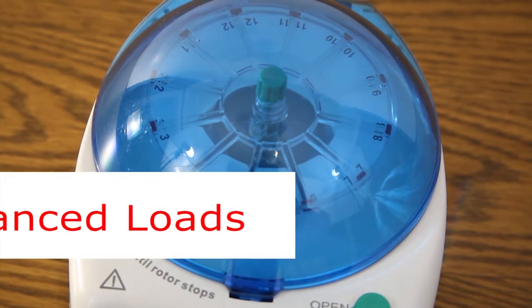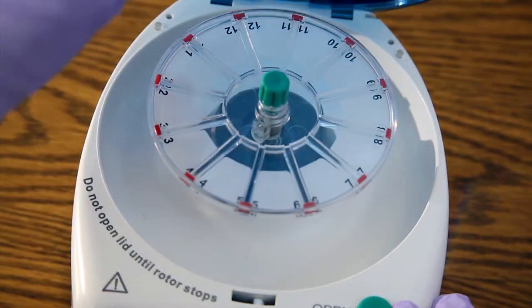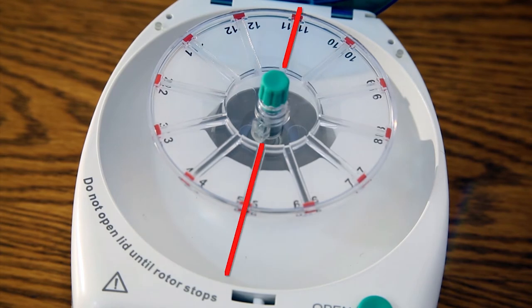Spin only balance loads where the tubes are placed opposite each other. Out of balance loads may damage the centrifuge and may produce improper sample separation. Load your tubes and use the digital controls to set time and speed.